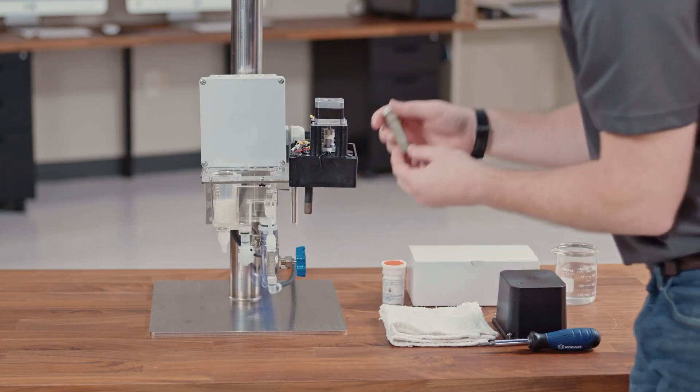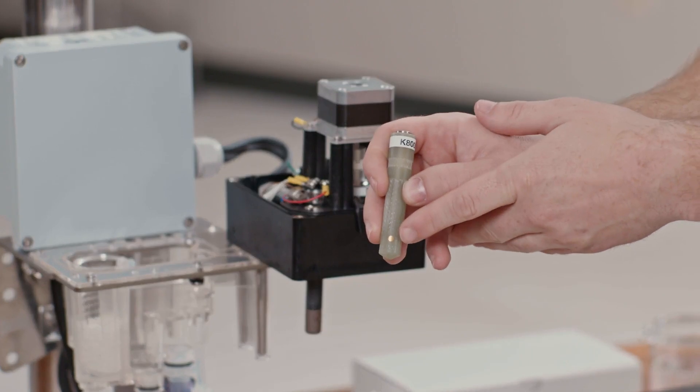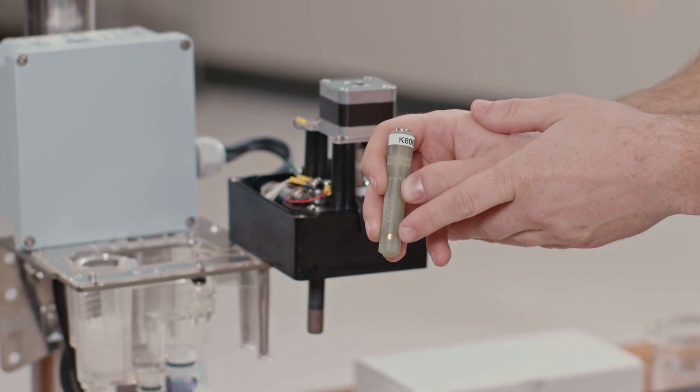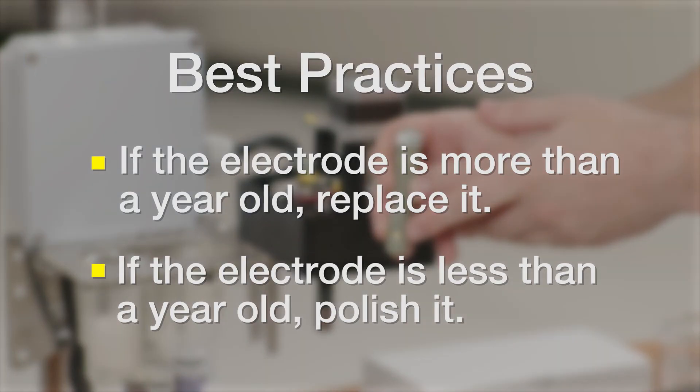Once you have removed the electrode, you can inspect it for any defects in the gold electrode. If the electrode is a year old, you can go ahead and replace it. If it is less than a year old, we recommend just polishing it to remove these defects.